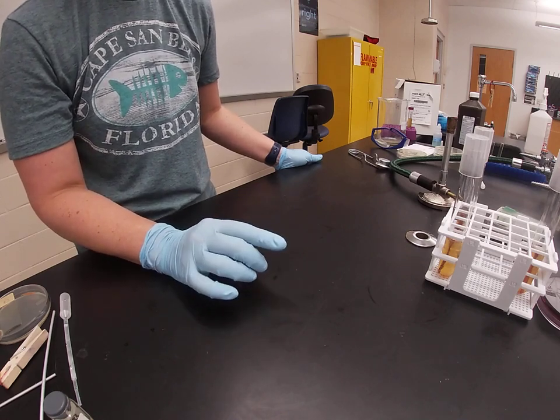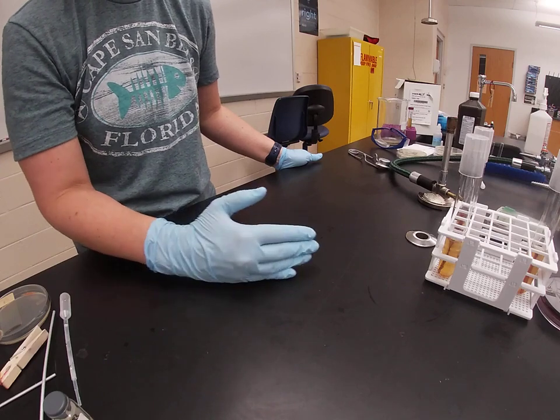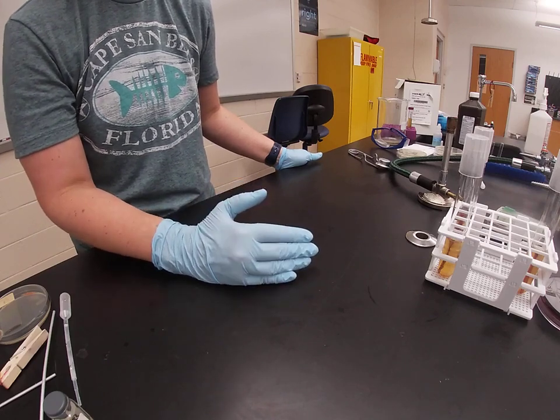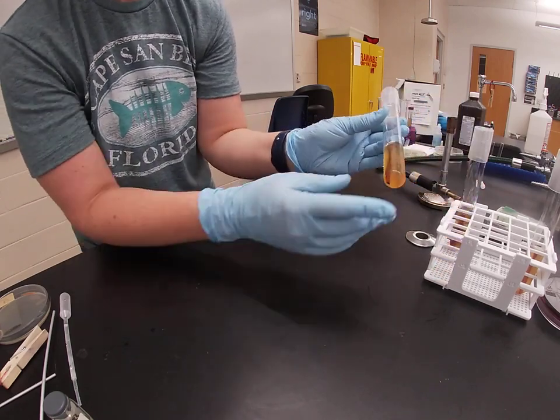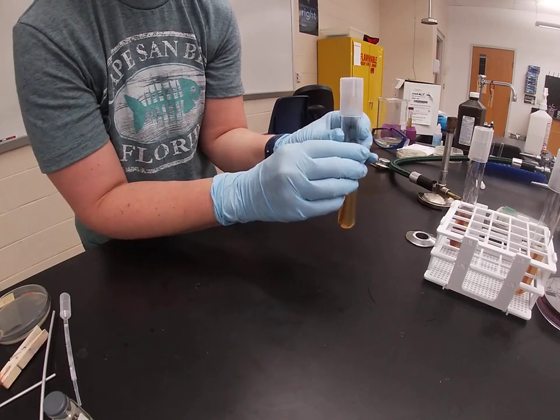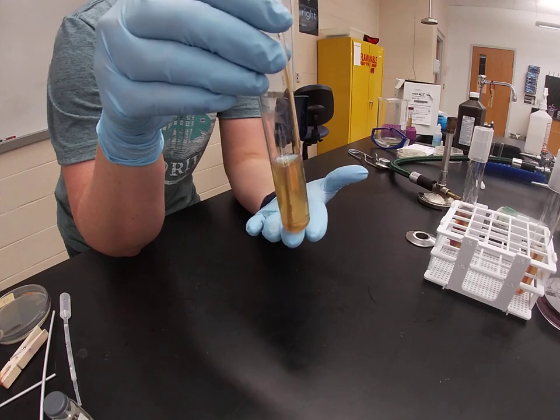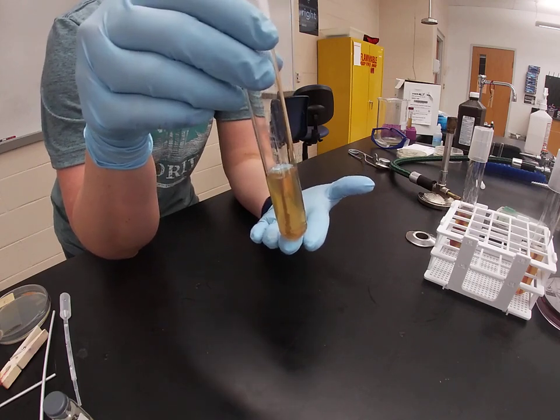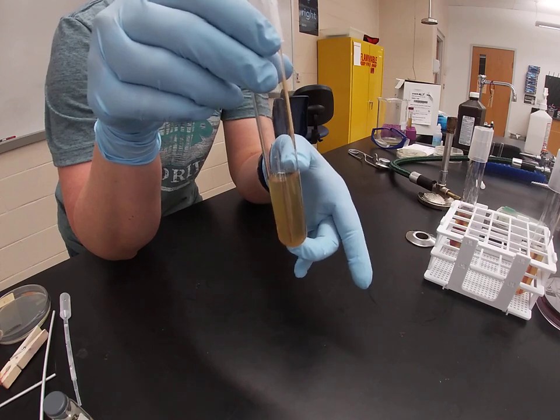The other thing that's different about motility agar is that instead of being made with the normal percentage of agarose or agar that we use in nutrient agar, we use a lower percentage, which makes the medium a little bit looser and easier for the organisms to move through. Motility agar comes in a test tube, and we pour it as a deep. So it's just a deep plug of agar in the bottom of a test tube.